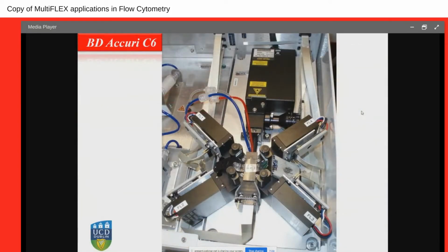As I said, it was slightly different, and one of the big differences is that they were using peristaltic pumps to move the samples, and this is the filter that we have here, and these are the tubing moving everything into the flow cell. We have here two lasers, the blue laser and red laser. They were both collinear, with forward scatter in the front, side scatter at a right angle, and then the photomultipliers were aligned at different angles than the right scatter. So it was kind of strange, but it was doing the job.